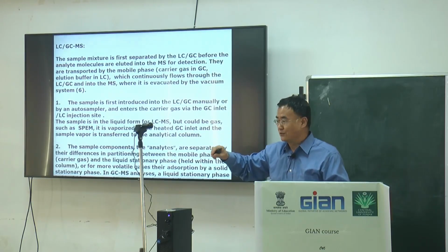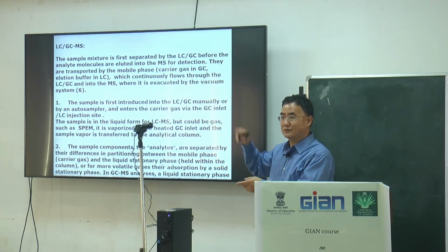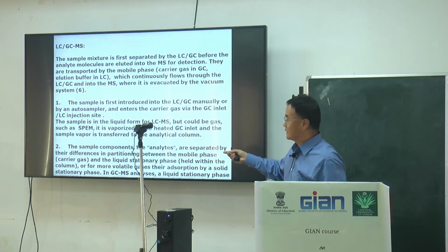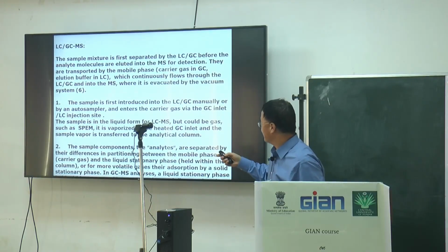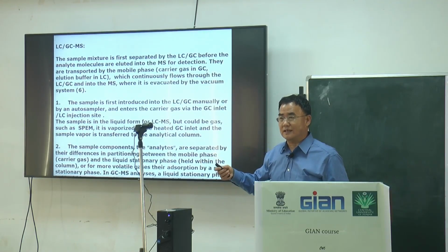Usually we put one layer of hexane so the products emitted from the solution go into it. Then we extract quickly and load the solution. But sometimes for GCMS we load with gas.